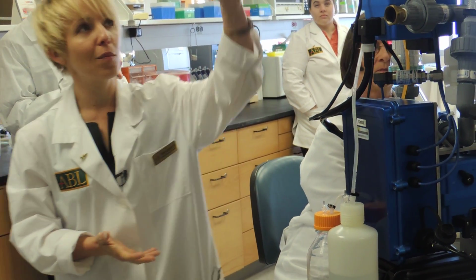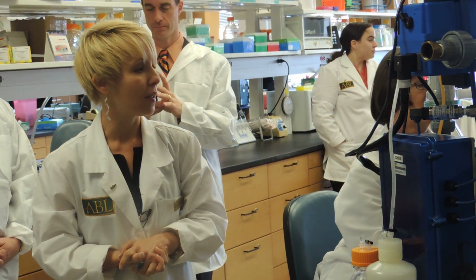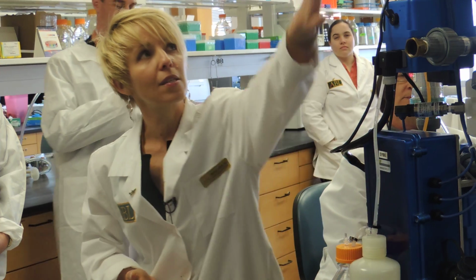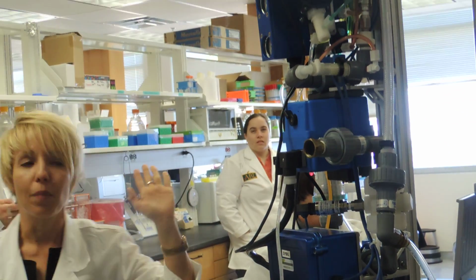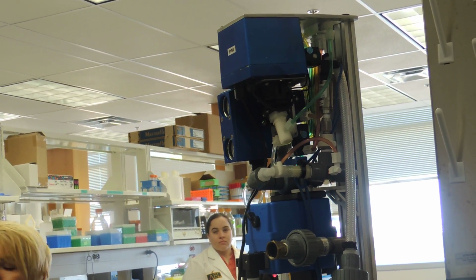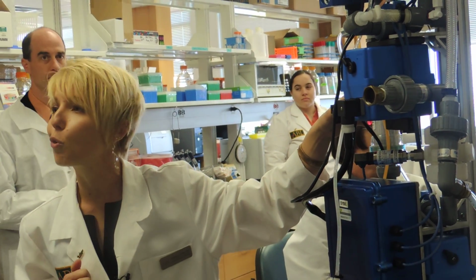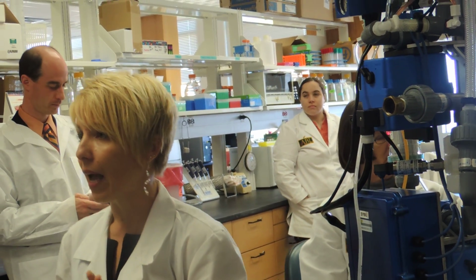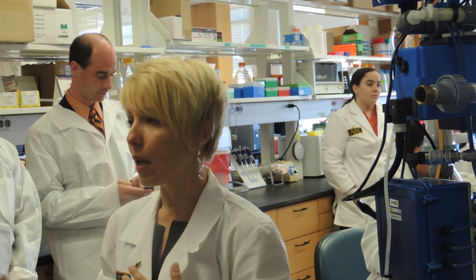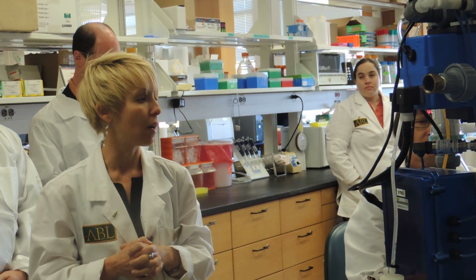So once you have come back to the lab, reattach the recovery portion of the unit, you can then tell the computer that yes, I am ready to recover my sample. And the first thing you are going to hear is that this metering pump will be activated again based on a program that the software is communicating to the device that will replace whatever remaining sample fluid from the river, from the drinking water that may have residual chlorine left in it. We're going to replace that fluid with our buffer solution that our sample will then be contained in to stabilize the organisms and to increase the concentration of our sample.